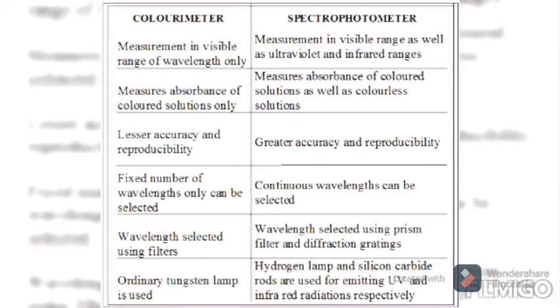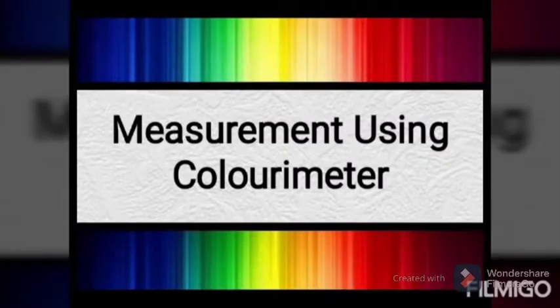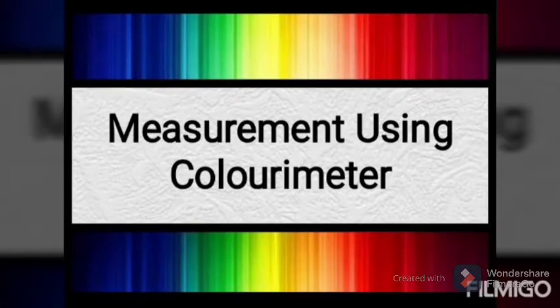You can go through this chart that shows the difference between colorimeter and spectrophotometer. It's a question that is usually asked for theory and practical exams. Now we can see how a colorimeter practically works.